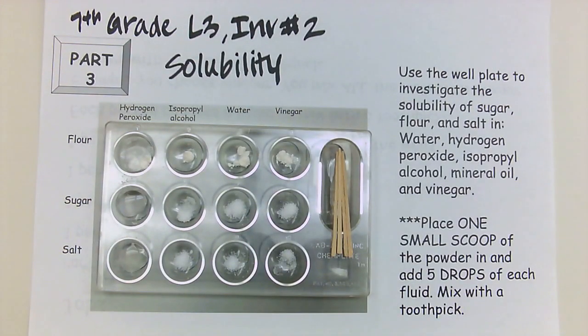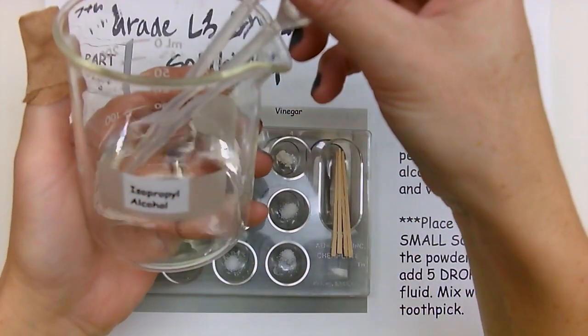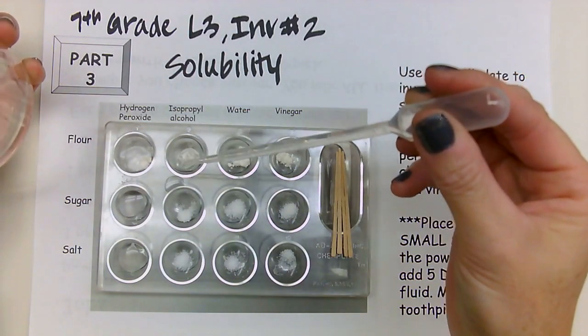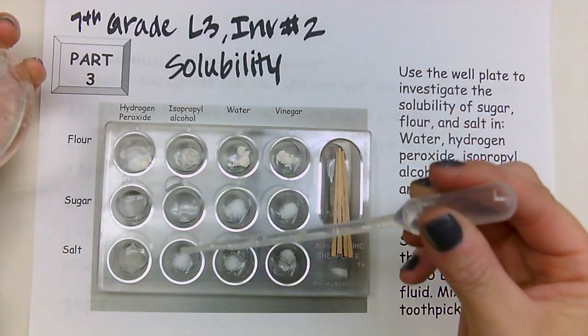Isopropyl alcohol, that's this one here, okay? So I'm going to put 5 drops in each well.